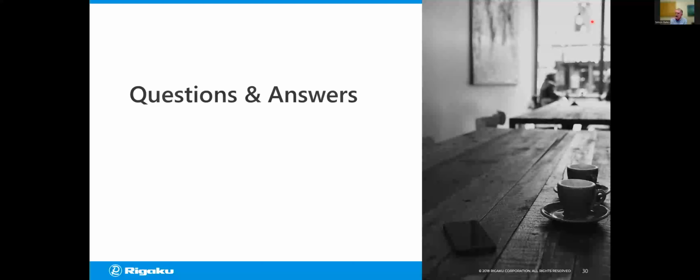So, I actually had a slide on that and I took it out because I wasn't sure how many people would know what Rietveld is. Well, in some ways it's similar in that it uses a whole pattern fitting and least squares to fit the data. So in that sense, it's similar. But in another sense, it's really very, very different because Rietveld is based on a Bragg approach, which is definitely not total diffraction. Now, Bragg is not really compatible with a total diffraction type concept.